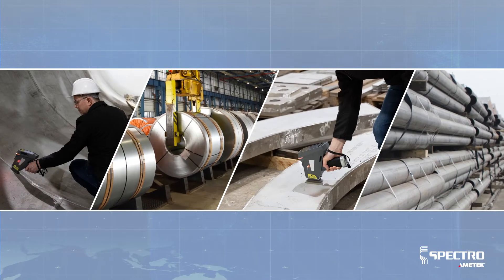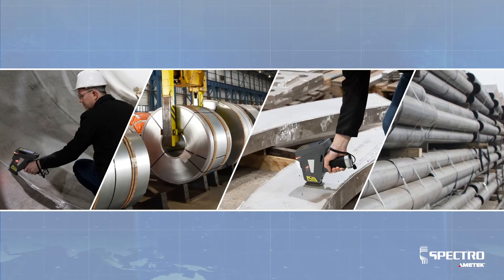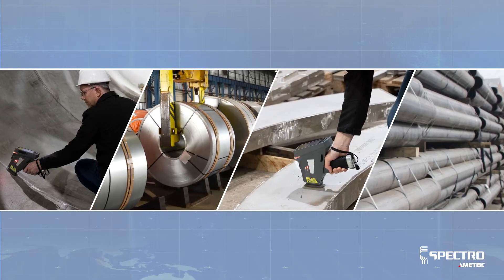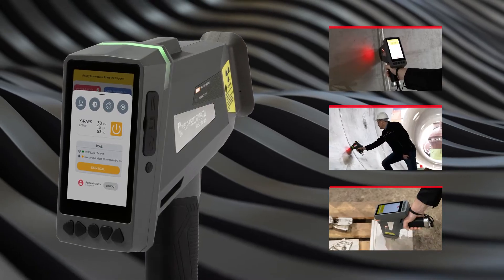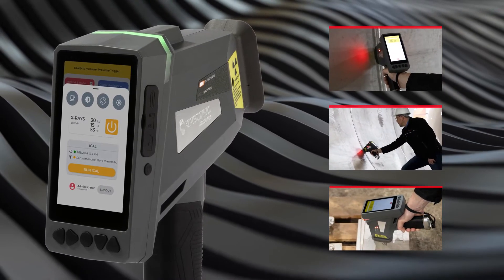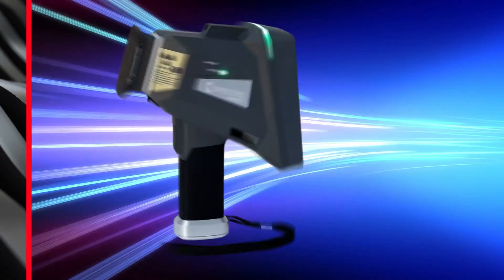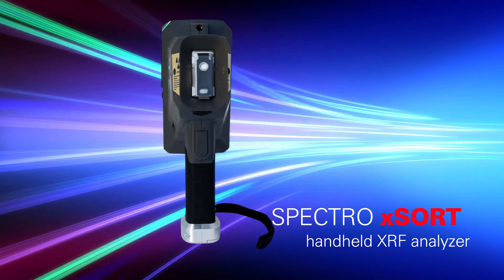For decades, best-in-class Spectro analyzers have been delivering accurate, rapid, reliable results on-site and in laboratories around the world. Now you can fit everything Spectro knows about metal analysis and X-ray fluorescence technology in the palm of your hand. Presenting the latest Spectro XSort handheld XRF analyzer.